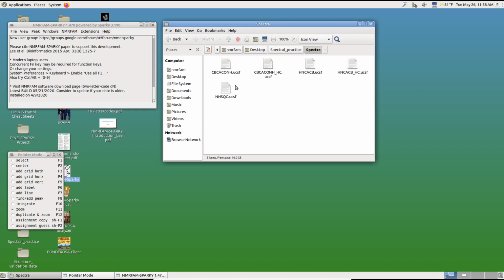So it has X and Y, and if that is 3D, Z, and those are the coordinates, and you have data height, which may be comparable to RGB values. And the spectra will be analyzed by Sparky, and that analyzed information, such as assignment labels, peaks, and contour level settings, will be saved in each save file.